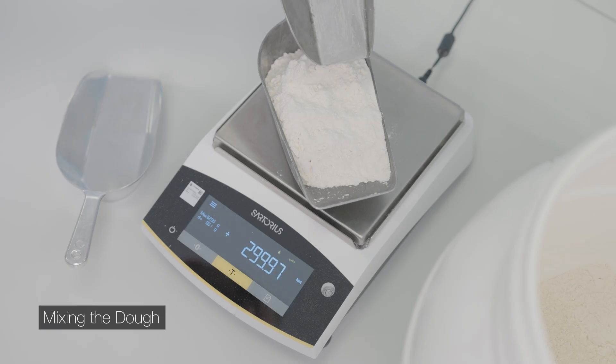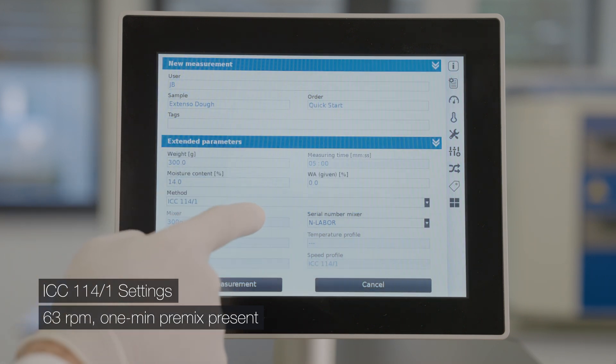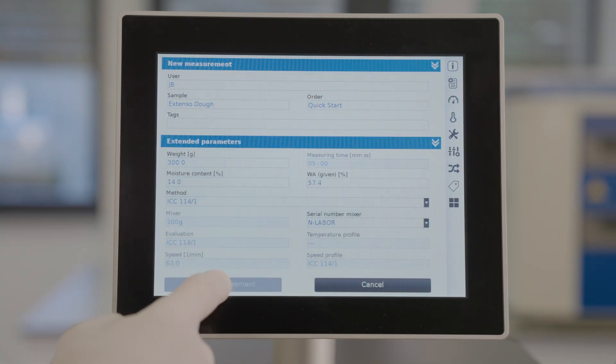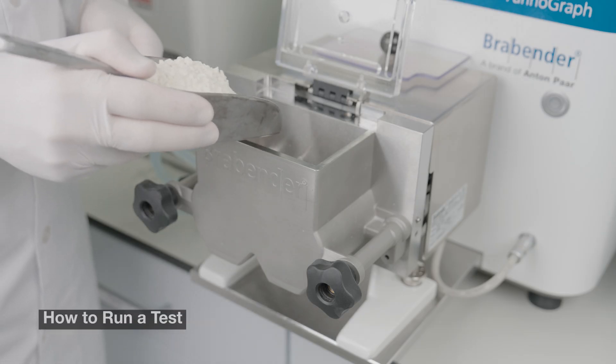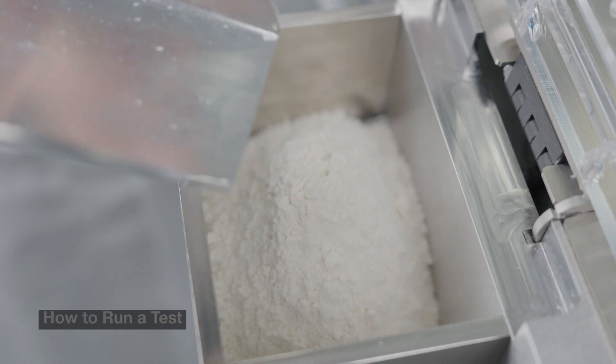Weigh 300 grams of flour. Select the ICC standard 114 over 1 and select water amount to achieve a consistency of 500 farinograph units. Start the measurement, add the flour into the farinograph mixer, and close the lid.